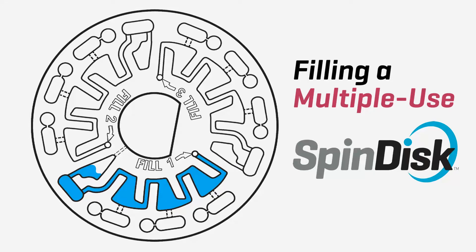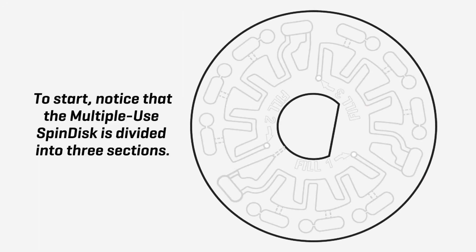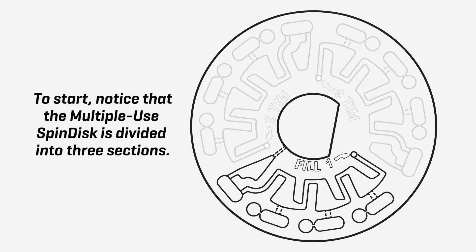How to properly fill your Lamotte SpinTouch multiple-use spin discs. To start, notice that the multiple-use spin disc is divided into three sections.